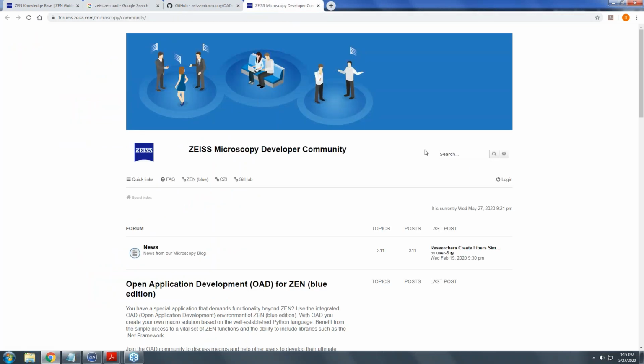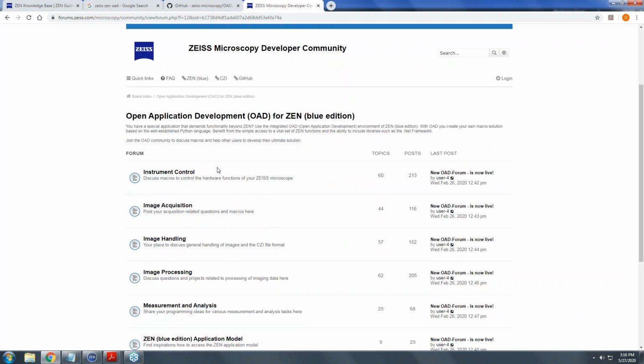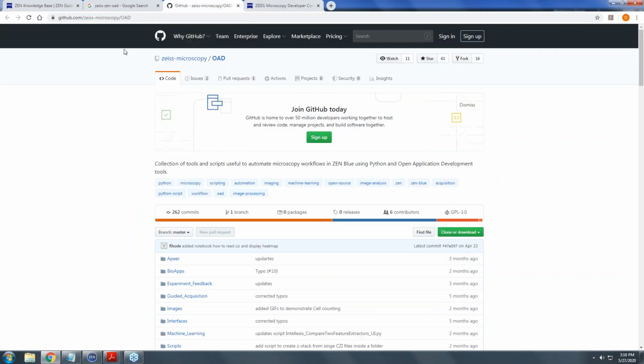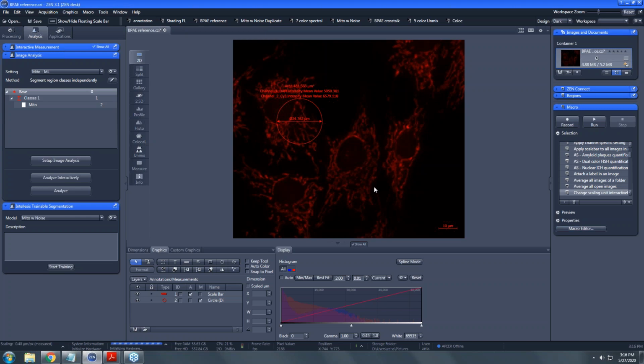There's also, maybe a nicer place to start, the Open Application Development news group. This is a posting of all sorts of questions and answers on all sorts of topics of using Python scripting within ZEN for image analysis and for instrument control. All sorts of automation in here. And you'll see postings from me asking questions all the time because I'm a self-taught, very poor Python scripter. Okay, terrific. So that's the scripting capability, open application development.